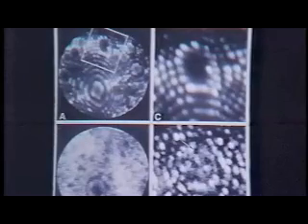And finally, a kind of very new example. This is some work that John Wren and I just completed. We were very interested in the question of using this process of field desorption and time gating for a species to ask the question, could we possibly look at large area surfaces? Everything I've told you about works well, smoothly, reproducibly, no problem, but you need a sharp tip. Question is that a problem?